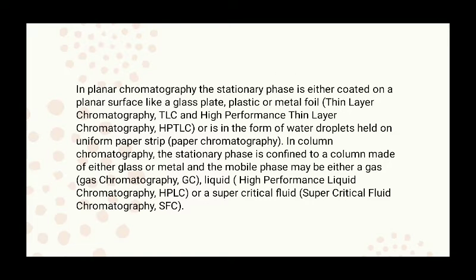In planar chromatography, the stationary phase is either coated on a planar surface like glass plate, plastic, or metal foil, as in thin layer chromatography (TLC) and high performance thin layer chromatography, or is in the form of water droplets held on a uniform paper strip, called paper chromatography.